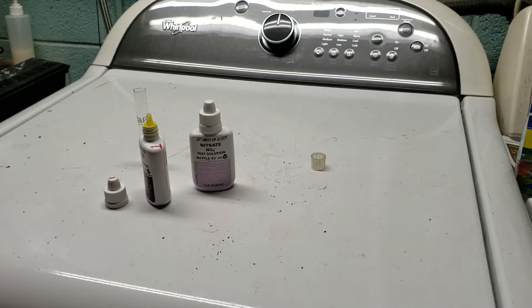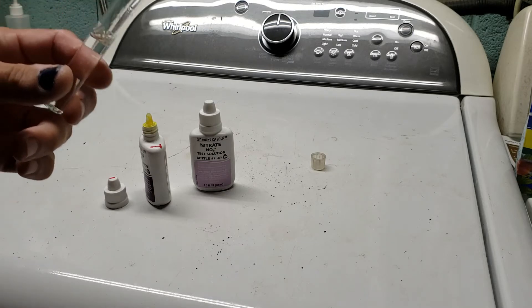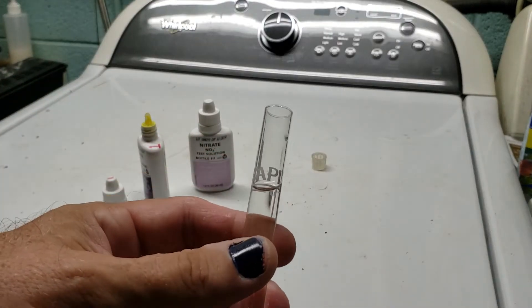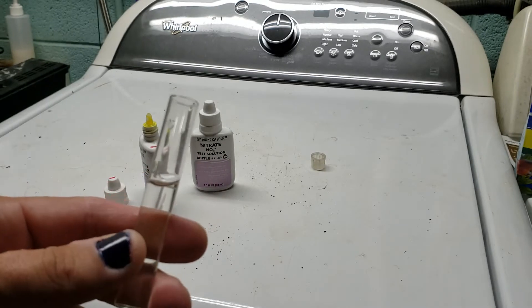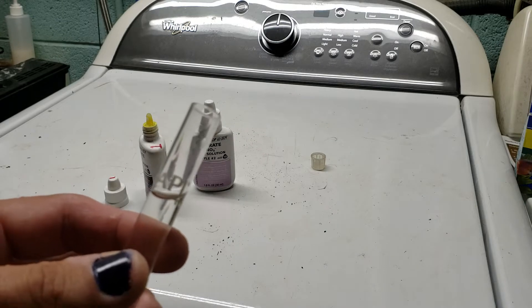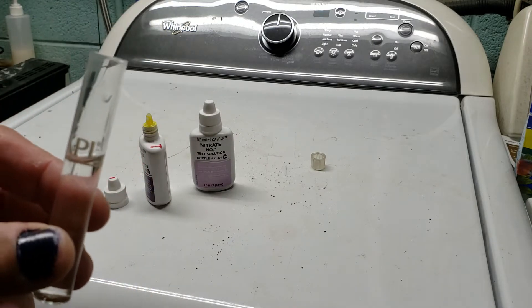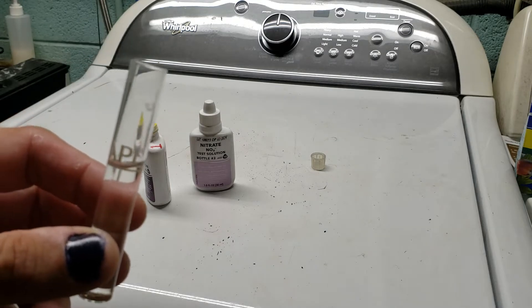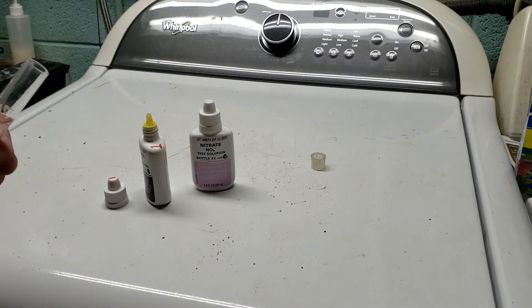I'm getting ready to test the nitrates in my 125-gallon tank, so I thought I'd go over how to properly do this test. I've tried it a lot of different ways over the years, experimented with things you can do and things you don't have to do. The instructions are pretty specific about certain steps, and a lot of that stuff is not quite as necessary as they make it sound, but some of it is also very important.